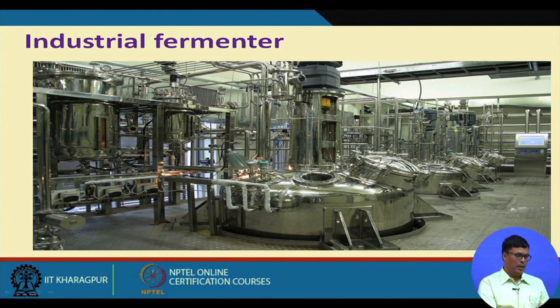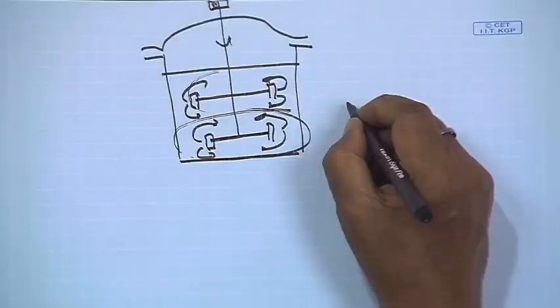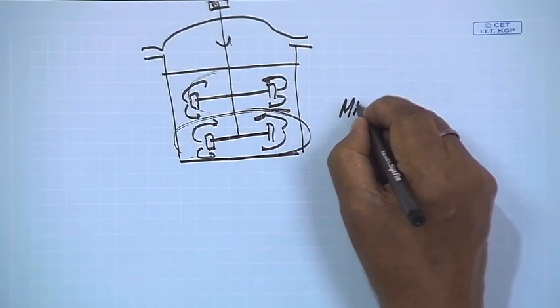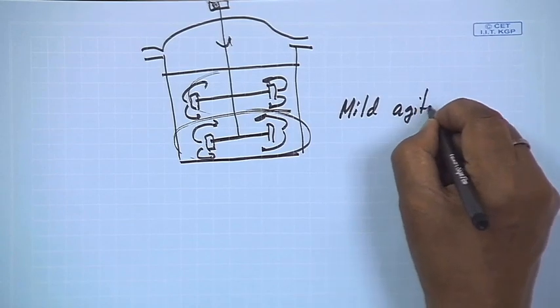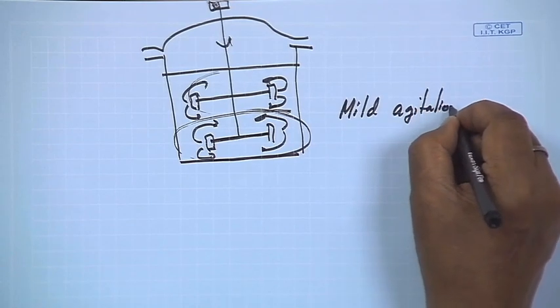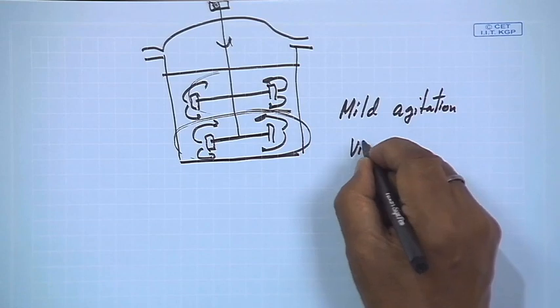Now here I want to point out the power requirement. We have mild agitation and vigorous agitation.